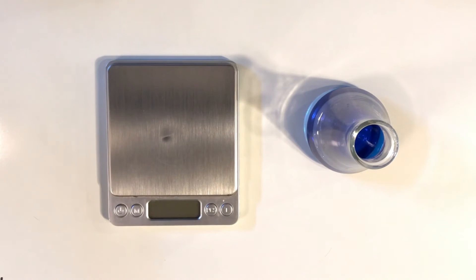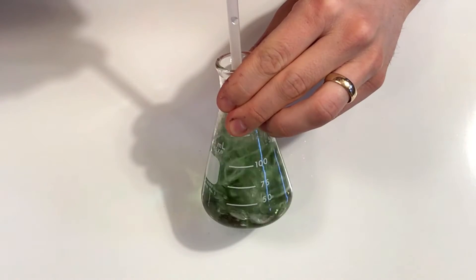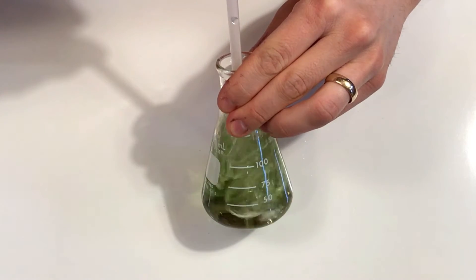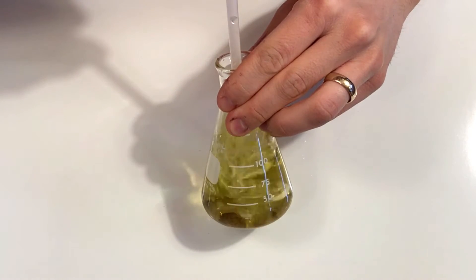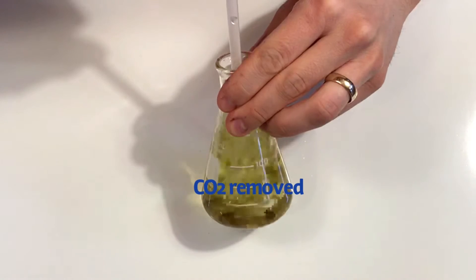To explore the question of what plants are doing with light, let's use the tools that we have available to us. We have a scale to record mass, and we have BTB to record the movement of carbon dioxide. Since we explored mass changes in the other video, let's now use the BTB. Recall how bromothymol blue works. If carbon dioxide gas is added to the solution, the BTB turns more yellow. If carbon dioxide is lost from the solution, the BTB turns more green or even blue.